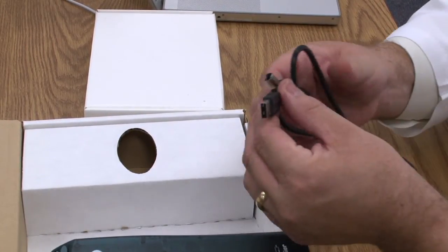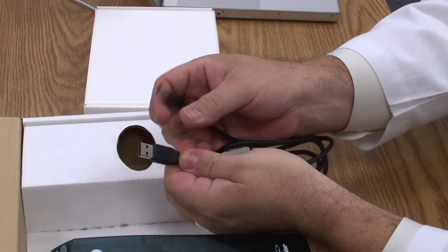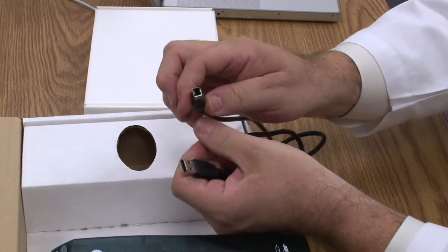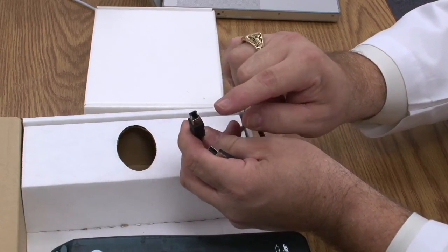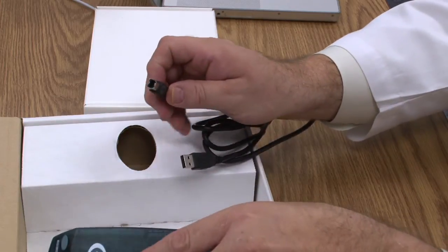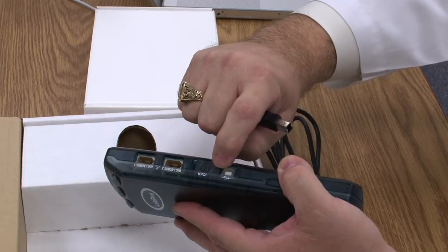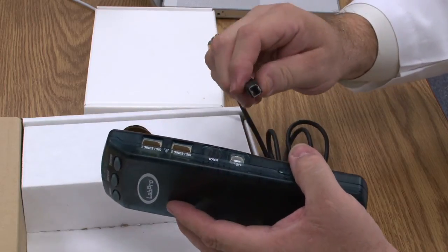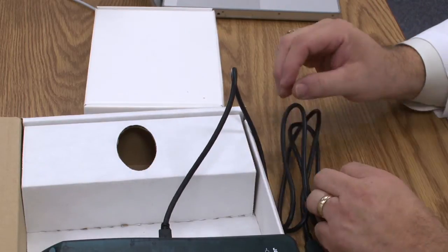The other long cable has two USB plugs on it. One of them is a traditional flat USB and the other is a D-shaped USB, commonly found on printers, scanners, and devices like that. By sliding the little slide to the front, you get an open USB port, and you can plug that cable in and connect it to your computer.